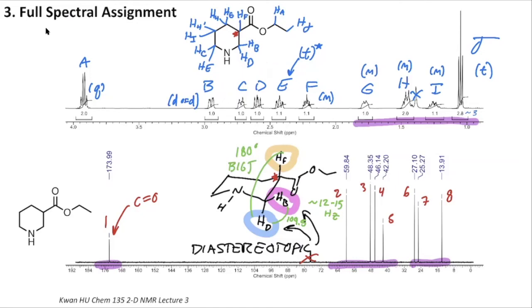We said that C looks more like a doublet of triplets, and D is truly a doublet of doublets, even if it doesn't look so much like it. That's the splitting that we would expect to see based on where it's positioned, and we can explain it using our overlapping doublet of doublets method. And now let's wrap up by talking about E.